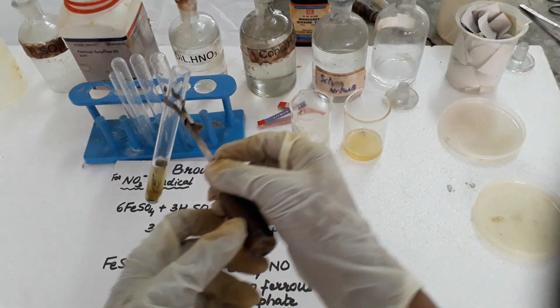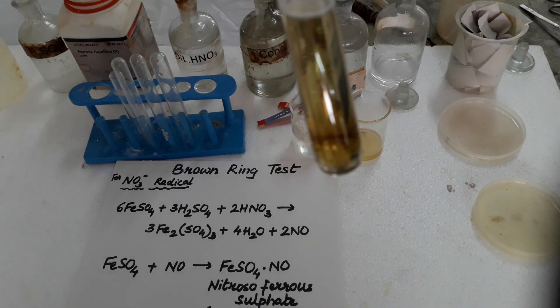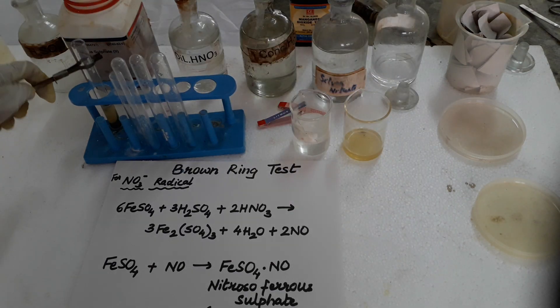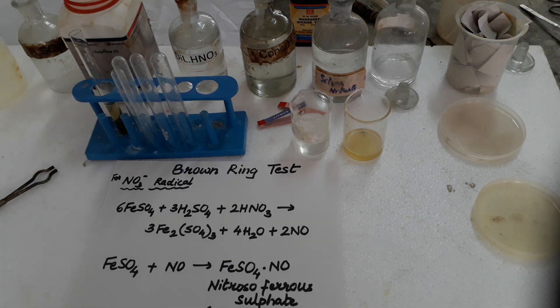So this is the brown ring test, which confirms that the salt has nitrate in it — I had taken potassium nitrate in it. You can see it very nicely here. Thank you, students.